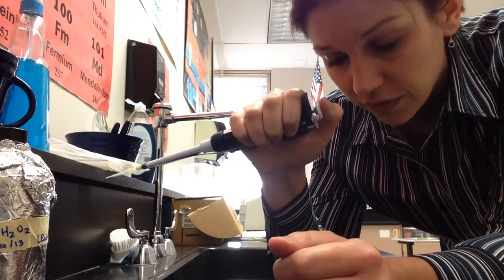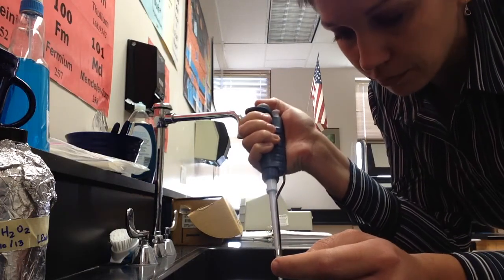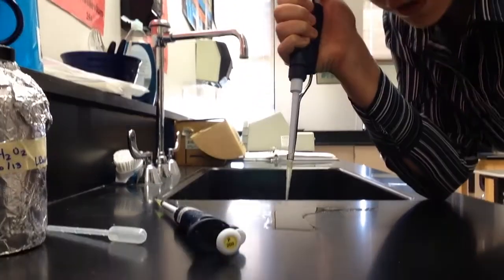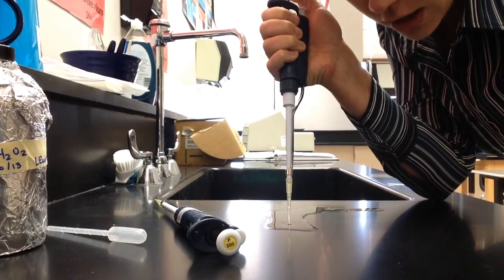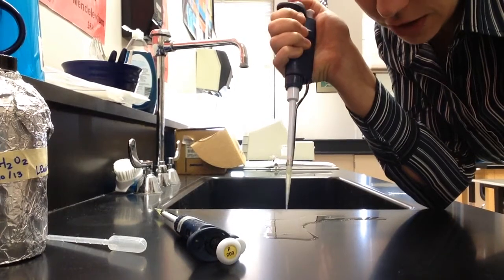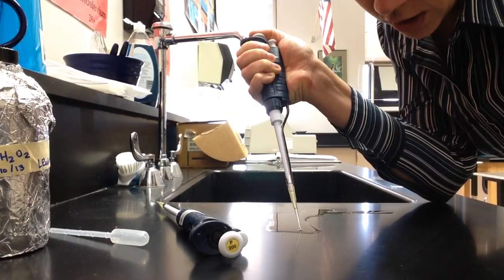Once you've gotten used to what it feels like, you submerge the tip of your micropipettor in the liquid. I have liquid just sitting on my table. You plunge the stopper down to the first stop, and then to draw the liquid up into the tip, you just release it, and you can see how it shoots up the tip. What you want to try to avoid is air bubbles. I got some air bubbles, so what I would want to do is squirt that out and then try it again, to get it without the air bubbles.